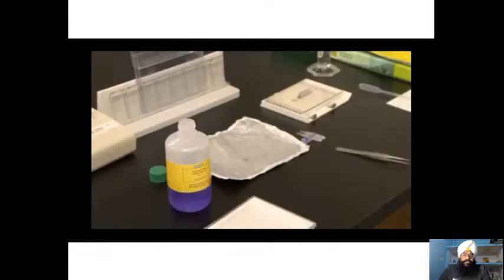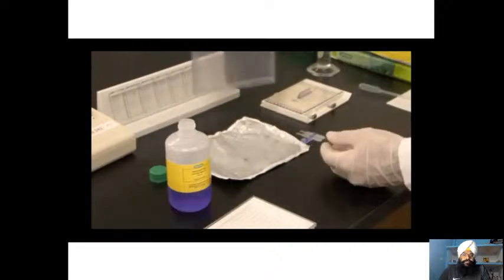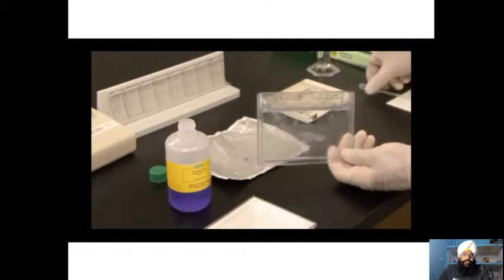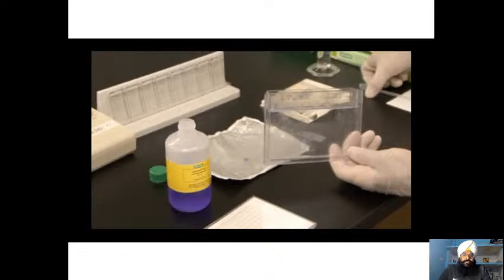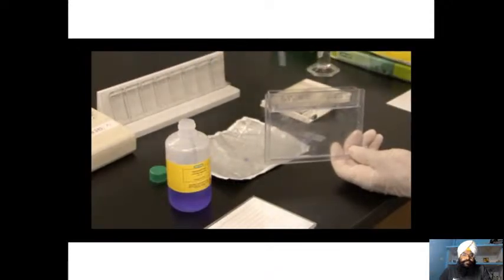At this point, we want to seal the IPG strip and standard gel plug into the well of the gel. I will use Protein Plus Overlay Agarose. Heat in the microwave oven until it boils, and when the temperature of the agarose is no longer hot to the touch, take the hot agarose and fill up the well. And do this in one rapid action, side to side.